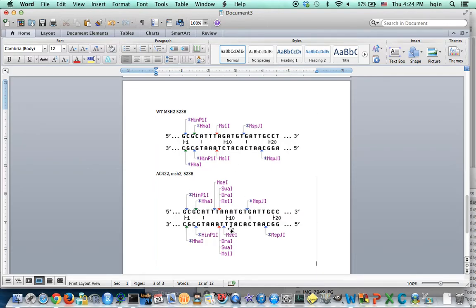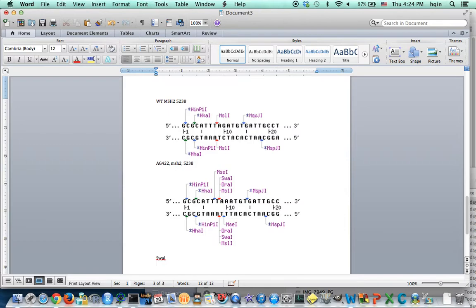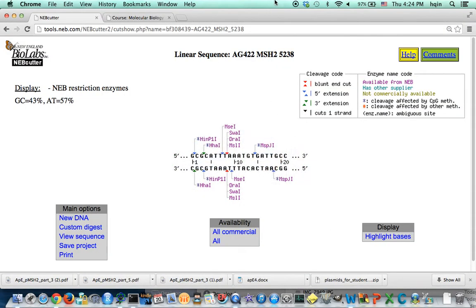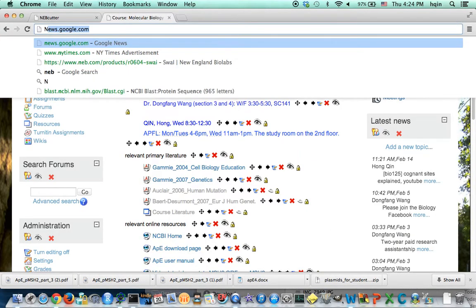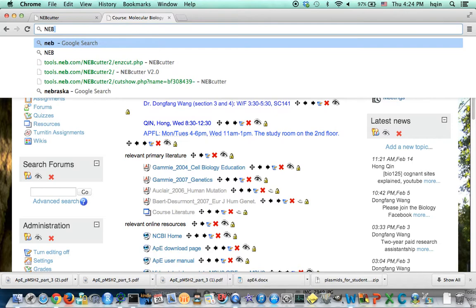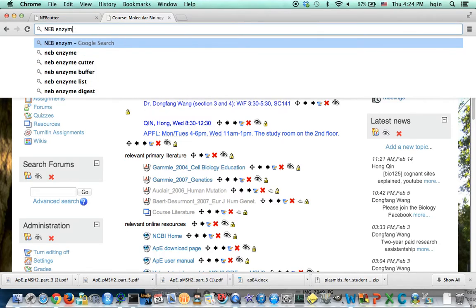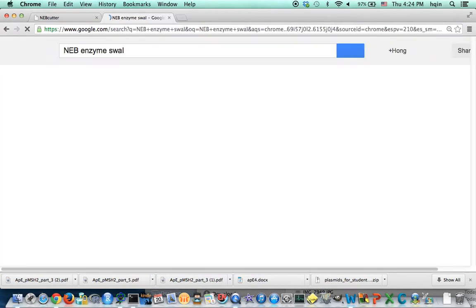So those are our choices. So for this one, if we pick SWA1, this enzyme will probably work. So then if we double check, go to the NEB site, double check NEB enzyme SWA1.